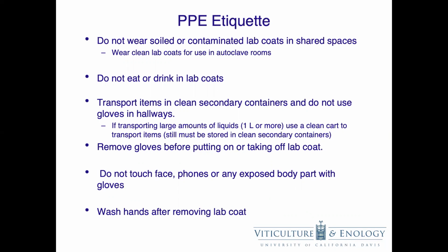If you're transferring something to a different location in the building, your items must be stored in clean secondary containers. Do not use gloves in hallways. If you're transporting large amounts of liquids, use a clean cart to transfer your items to avoid dropping and spilling. These items must still be stored in secondary containment.